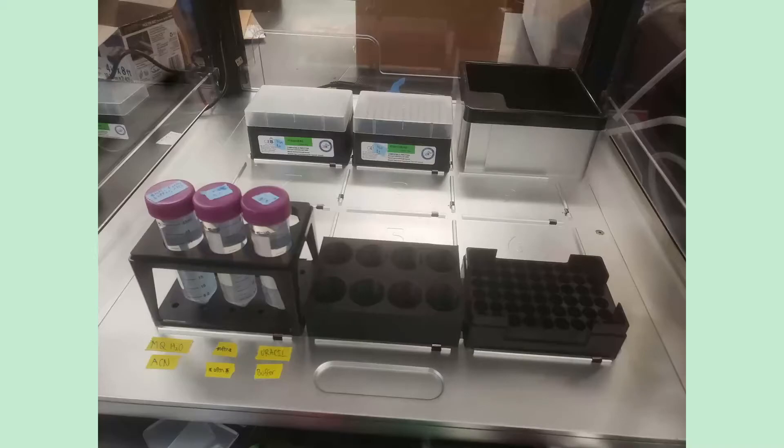This isn't all the hardware available — since you can 3D print your own stuff, there are virtually infinite possibilities. Among the OpenTrons offerings there's also a holder that combines four slots for 50 milliliter tubes and four slots for 15 milliliter tubes. There's really a whole bunch you can do with this robot.